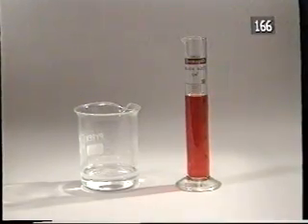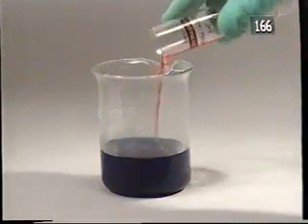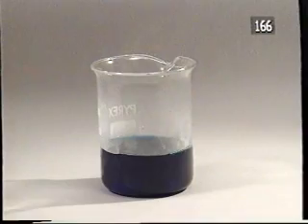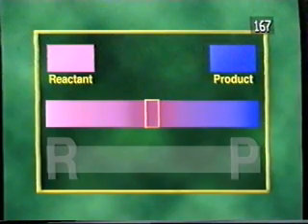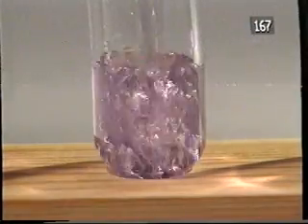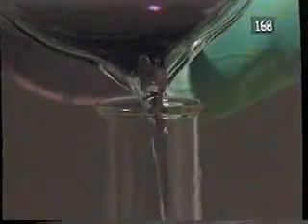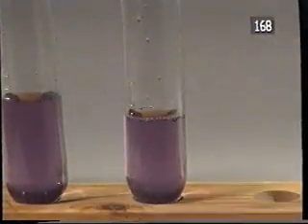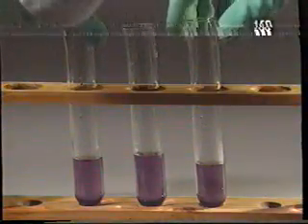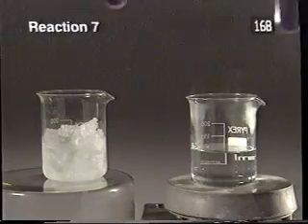It involves the conversion of a pink reactant to a blue product. The conditions can be adjusted so that the mixture contains equal amounts of the pink reactant and blue product to give a violet-coloured solution. In the following experiments, use these colours to identify what substances or mixtures we start and finish with. In particular, write down in your study file what changes occur and what may cause them. A beaker of boiling water and a beaker of ice.